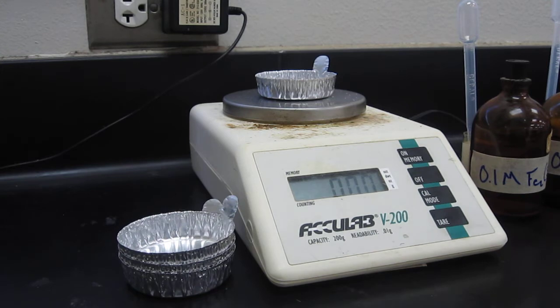So we can just put stuff in that weigh boat and see what the substance weighs. As you can see, when I put more and more in, the balance shows an increase in mass — we're almost there.